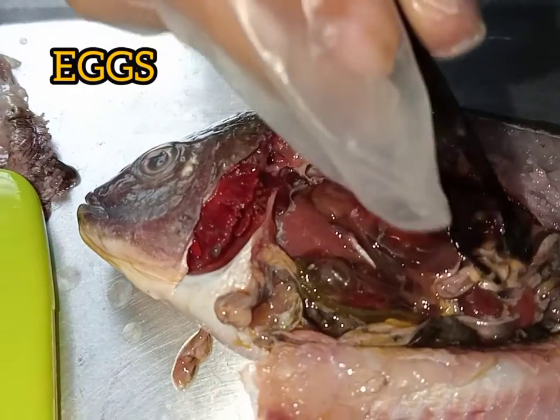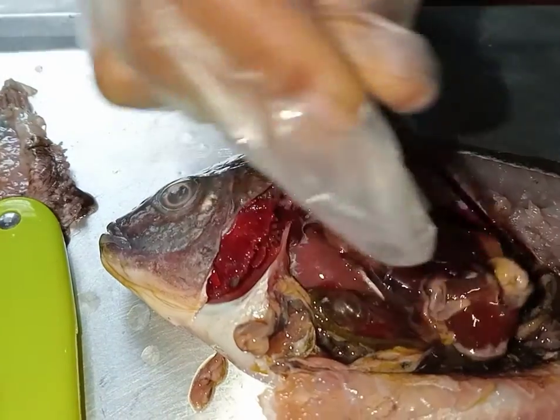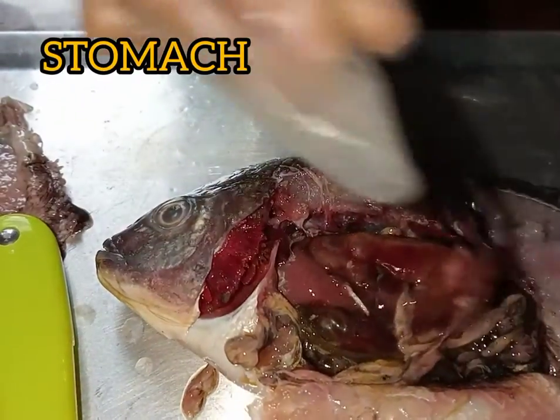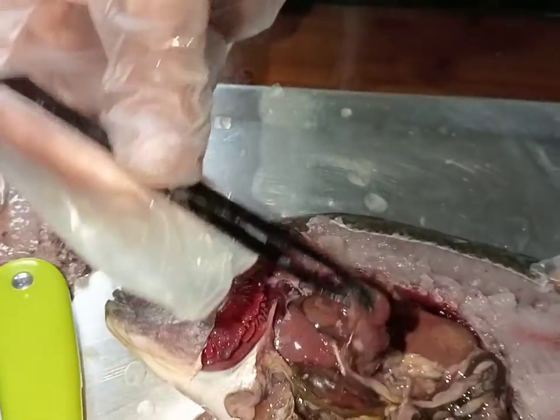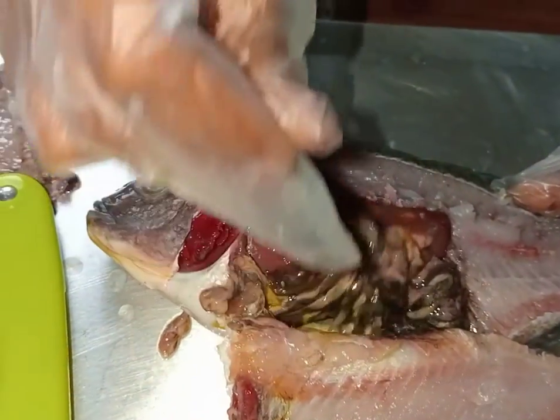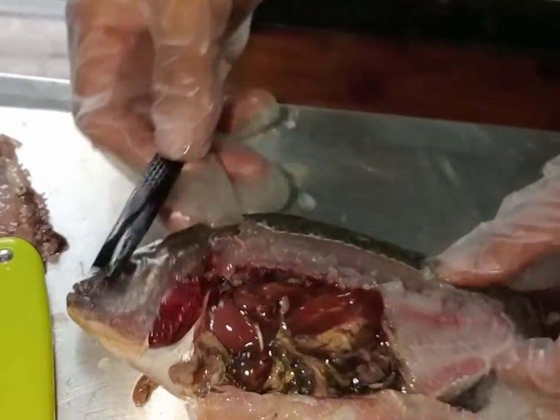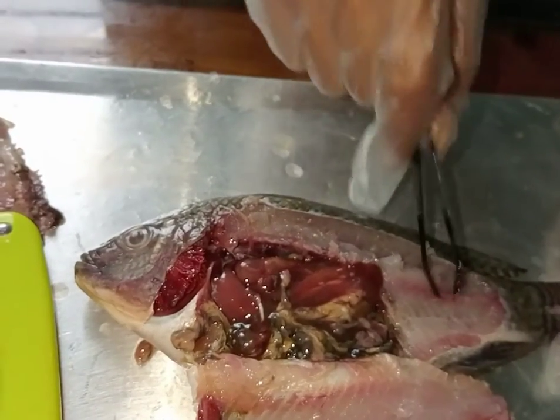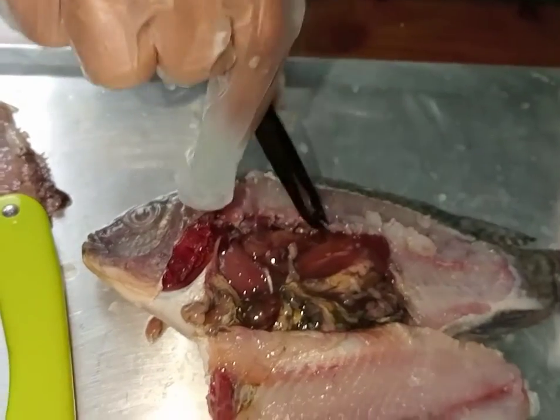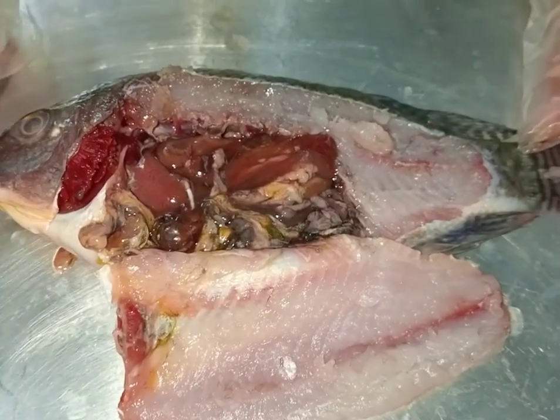And this is the eggs of the tilapia. And now, this is the muscles of the tilapia. And lastly, we have here the spinal cord of the tilapia.